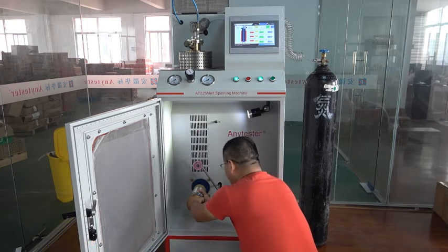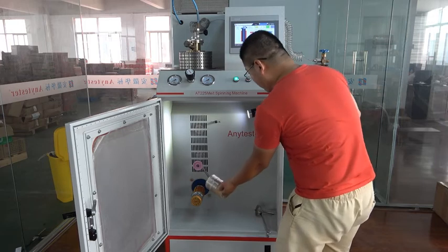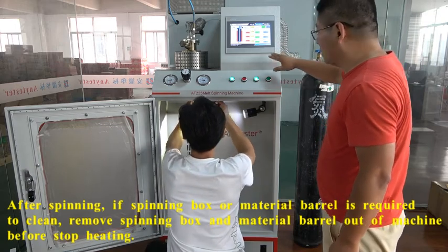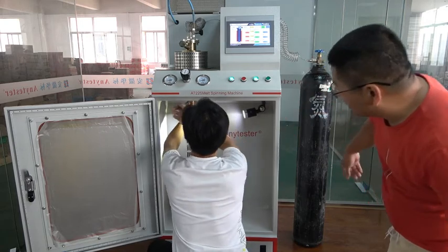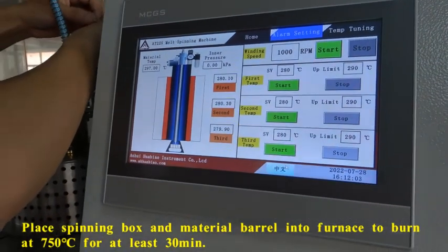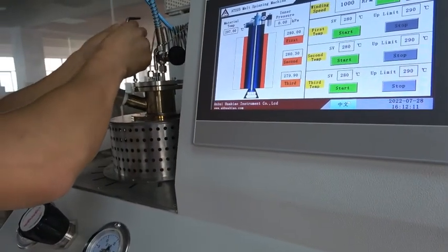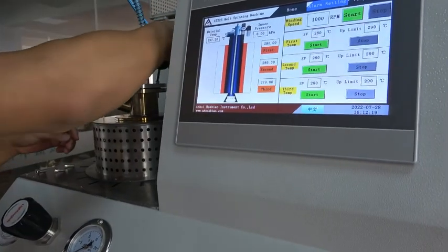Use the extension roller and then move the paper tube out of the extension roller. After spinning, before turning off the heating, remove the spinning box from the material barrel from the down side using the special spanner. Then remove the material barrel out of the machine and put it into the furnace.